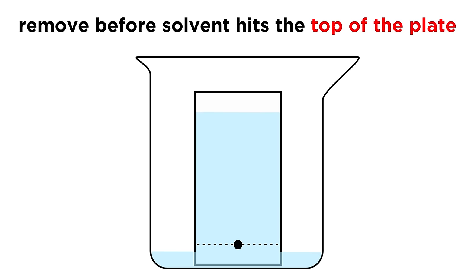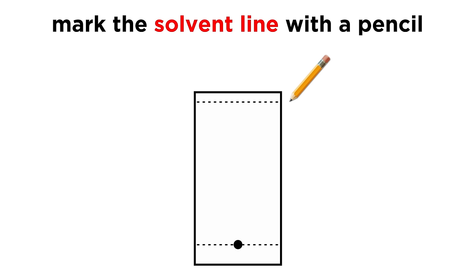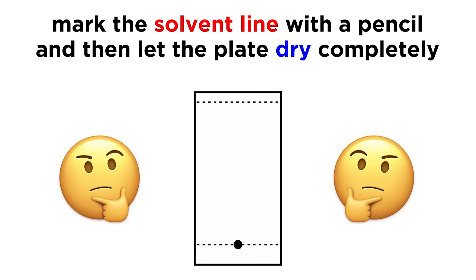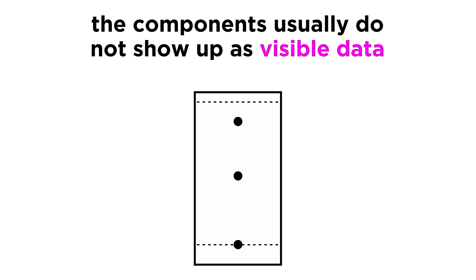Once the solvent is rather close to the top of the plate, but making sure not to let the solvent reach the edge, we remove the plate and quickly use a pencil to mark the solvent line, as this will not be visible in a few moments. Then we let the plate dry. Now it's time to see how far each component traveled. It is possible that the components are visible, but this is typically not the case, so we usually have to use a special technique to see where they are on the developed plate.